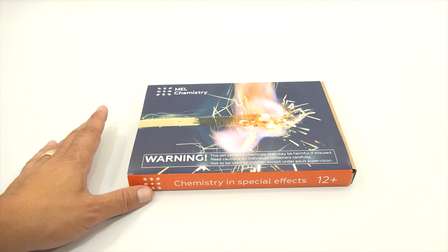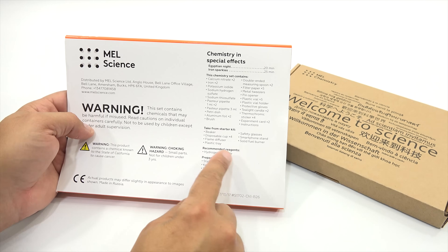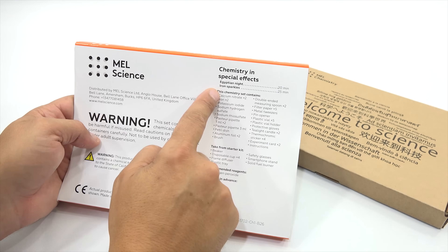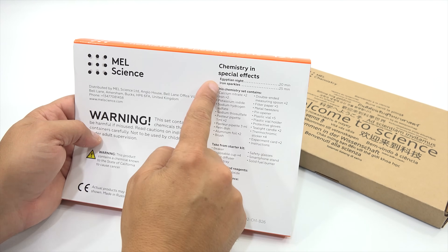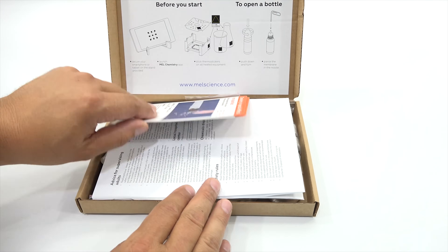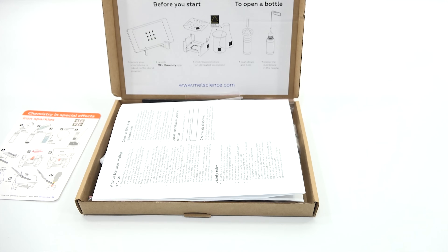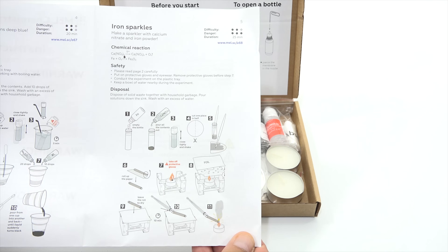So this is usually wrapped in plastic. There is information on the back, which you should always look at because you'll need to prepare in advance some items. Here is what comes out of the big starter kit, and here is everything in this kit which lets you do these two experiments. I've done Egyptian Night — that was really cool where two chemicals combined to make a really dark black liquid. And now I'm going to do the iron sparkles, 25 minutes total. They give you little cards that come with each experiment, and you can scan a QR code that gives you the directions. They also give you another sheet with directions, so you have plenty of places to get the information you need to do the experiments.